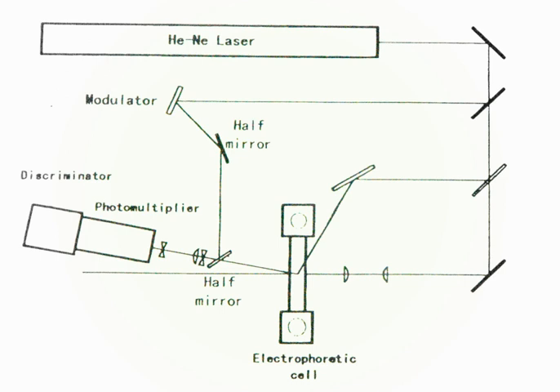Electrophoretic light scattering, also known as laser Doppler electrophoresis or phase analysis light scattering, is based on dynamic light scattering. The frequency shift or phase shift of an incident laser beam depends on the dispersed particle's mobility. In the case of dynamic light scattering, Brownian motion causes particle motion. In the case of electrophoretic light scattering, an oscillating electric field performs the same function.